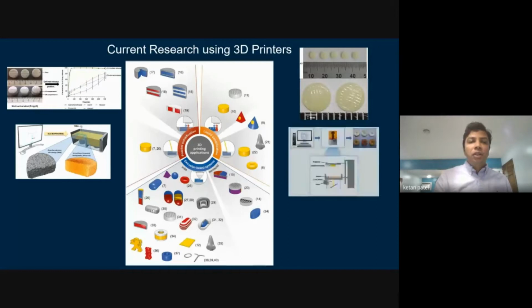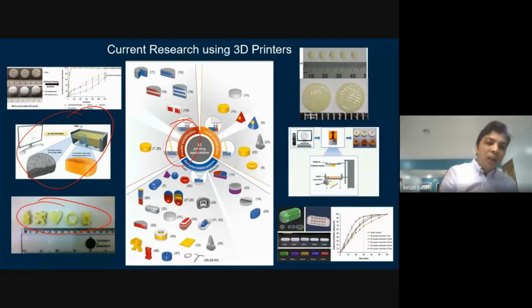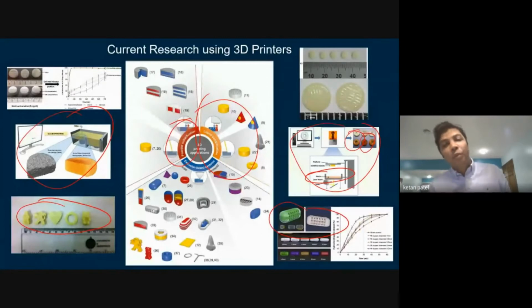The current research, I'll go over real quick in different areas. That's the powder bed technology, SLS 3D printing. With FDM, the advantage is you can print different shapes and sizes, such as a tablet with channels in it, so the drug and water can come in and out very easily to modulate the drug release. Then there is liquid solidification, where the lithography technique is involved, where you can print tablets that are super hard as well. You use some kind of resin, which is not an FDA approved material for drug delivery.